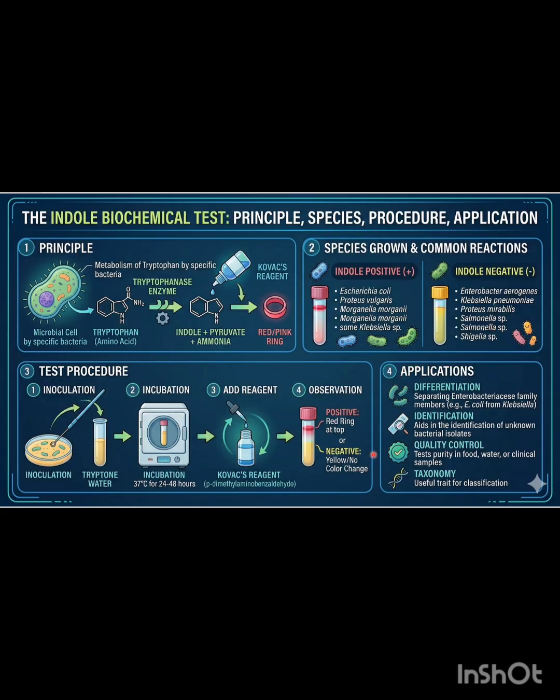And these are some common applications: differentiation of the Enterobacteriaceae family, identification, quality control, and also taxonomy purposes.